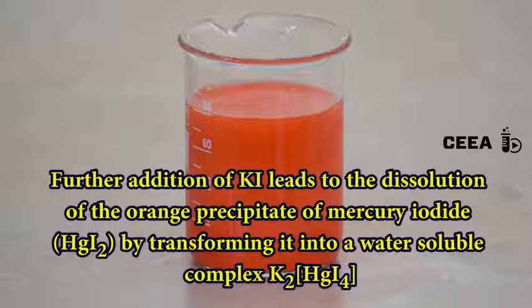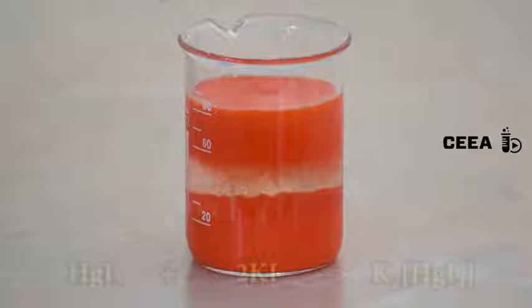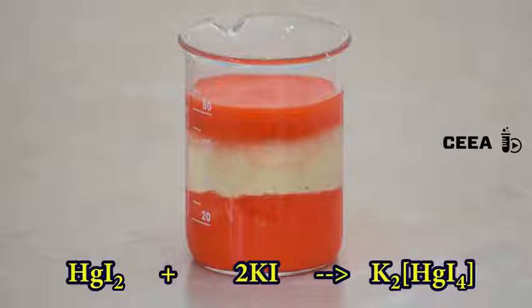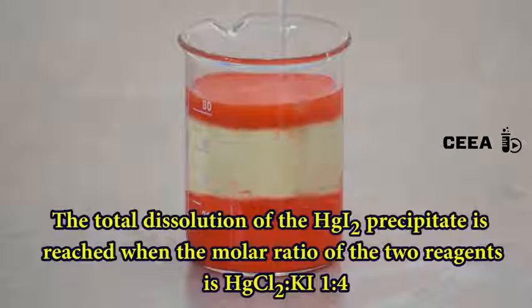Further addition of potassium iodide dissolves the precipitate by forming a soluble complex. The equation describing this process reveals the formation of the potassium tetraiodomercurate. At a molar ratio of 1:4 mercury chloride to potassium iodide, we get the complete dissolution of the mercury iodide precipitate.